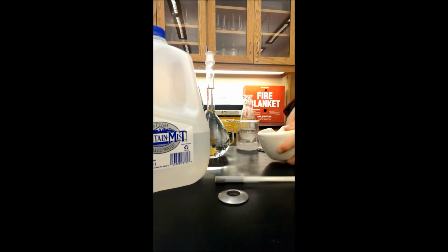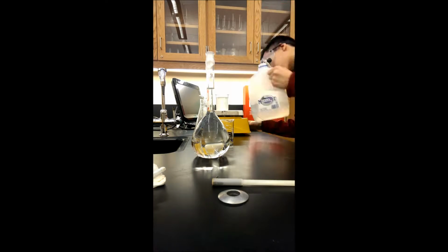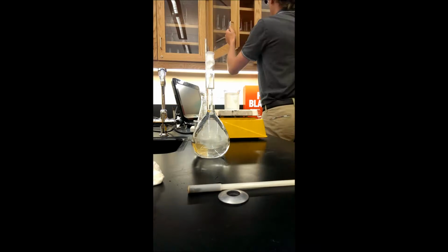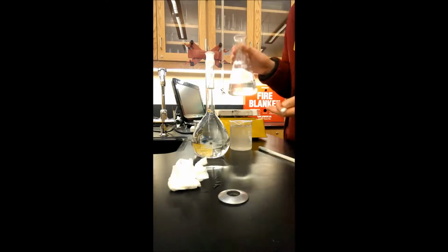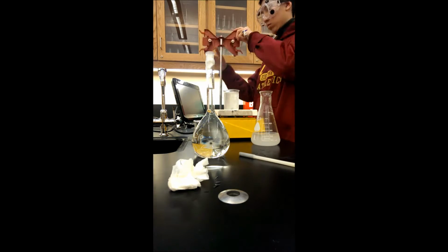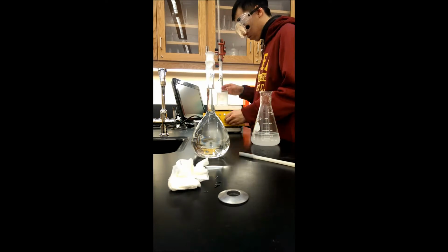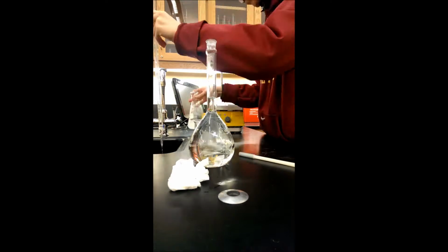experiments, but unfortunately, apparently, the pill doesn't dissolve in water, even though I used a mortar and pestle to break it up, and so it didn't work. It's kind of awkward, but here I am starting up the titration here, and it turns out nothing's going to happen no matter how much iodide solution I put in there because there really wasn't that much iodide in the solution actually.